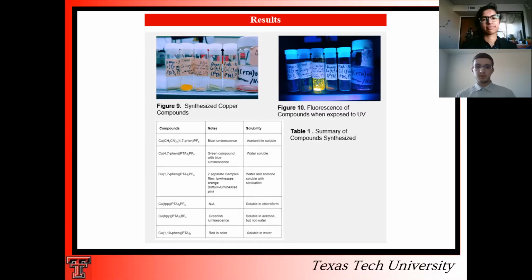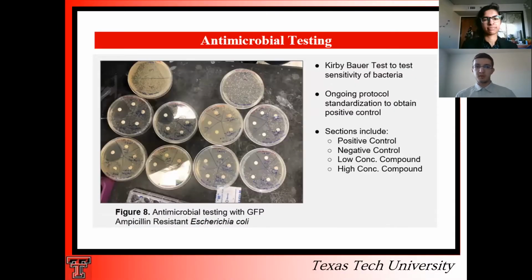In addition to this, we're also doing NMR. We're doing both hydrogen NMR, and we're also going to do phosphorus NMR, because as I mentioned previously, PTA has phosphorus atoms in its structure. So we'll be able to look at those compounds that have PTA in them using phosphorus NMR. And lastly, we'll also be doing a lot of UV-Vis. These experiments that I mentioned are all for the purpose of characterizing the products that we made and making sure that we're actually successfully carrying out these reactions. Next up, Neeti is going to talk about some of the microbial work that we've done so far.